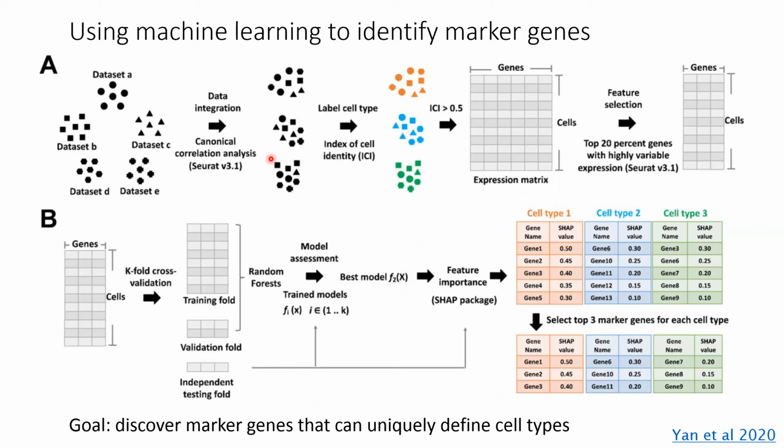However, in the context of machine learning and cell type clustering, there's a key difference. Differential gene expression evaluates each gene for its expression level variation between groups of cells, whereas marker genes are tested for their classification power. So further, differential gene expression tests each gene's expression individually across groups, while marker genes are tested using machine learning for their combined ability to classify a set of cell types.